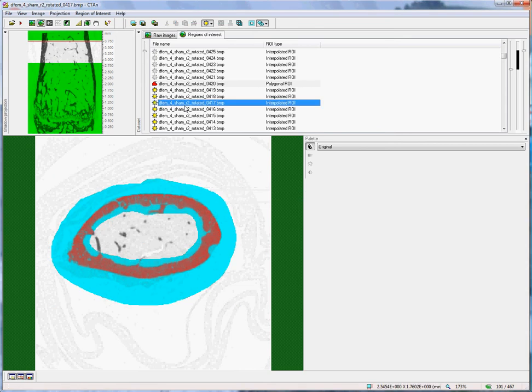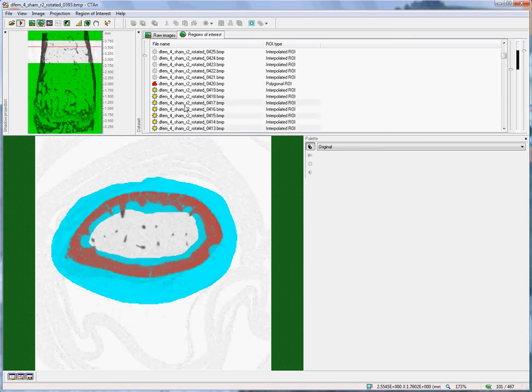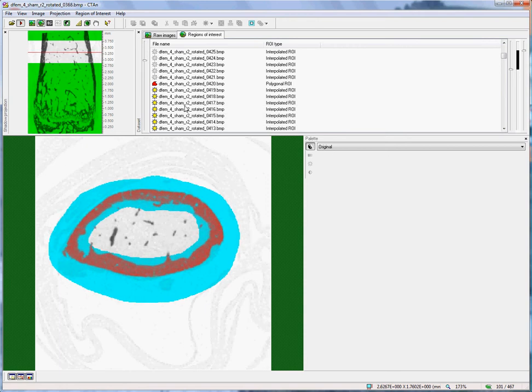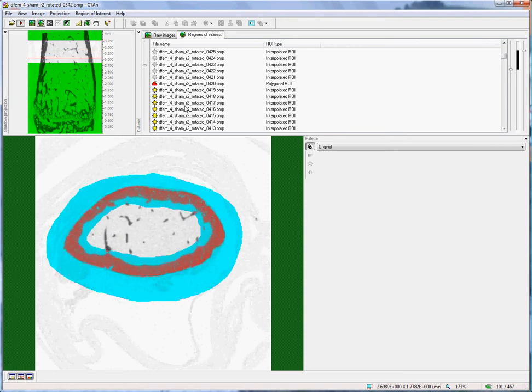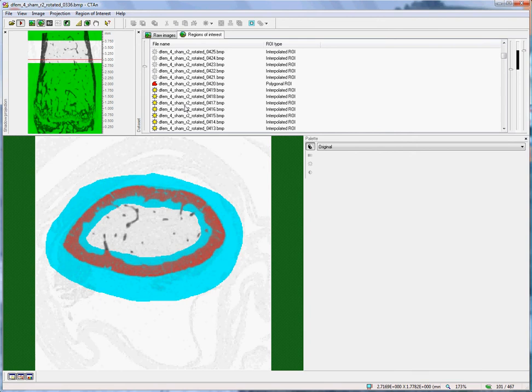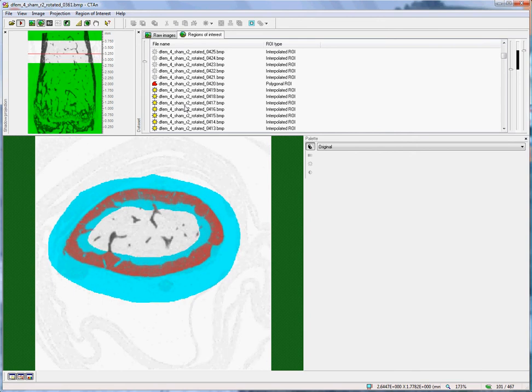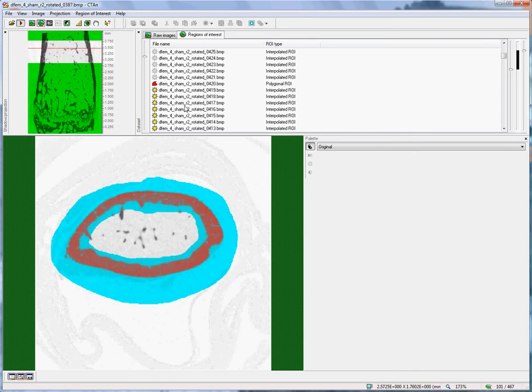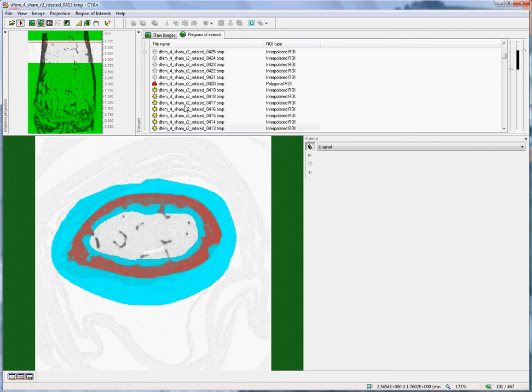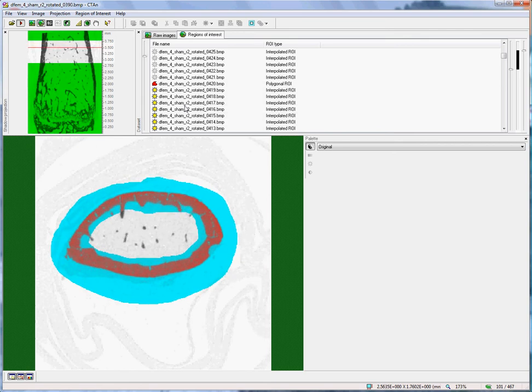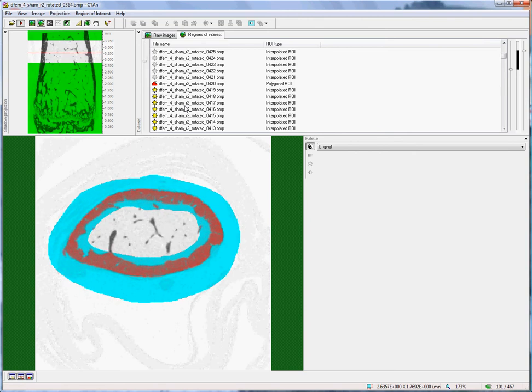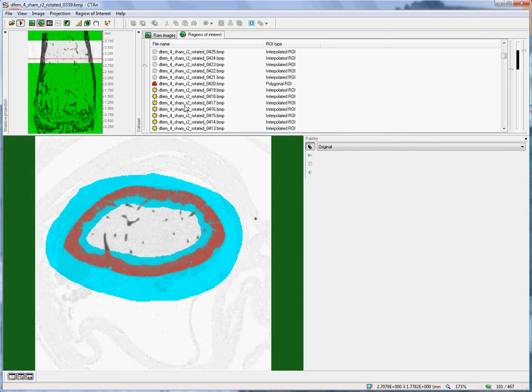Having delineated these two shapes, we click on the space bar to animate between them and to check that our region of interest is acceptable. Once again, we're mostly concerned to make sure that it is not biting off any parts of the cortical bone.